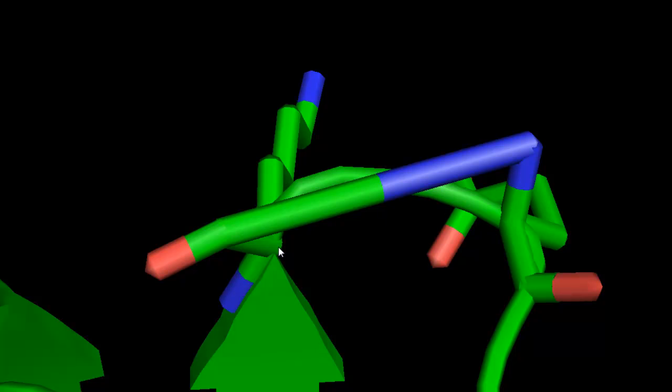However, these techniques that I'm showing you, these deletions and forming of this peptide bond, it's really helpful if you want to delete residues to show in a presentation or to plan out an experiment. But keep in mind, there are limitations to this program.